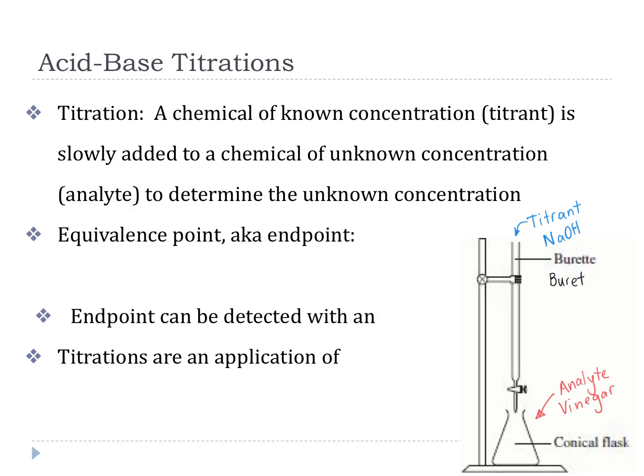And we are always in a titration seeking what's called the equivalence point. At the equivalence point, the moles of the analyte that we have in the flask below, that we're trying to analyze, are equal to the moles of titrant that we have added. So we don't know how many moles of analyte we have, but if we slowly add titrant until we get to something that indicates we're at this special equivalence point, then we will know that the moles of titrant are equal to the moles of analyte.